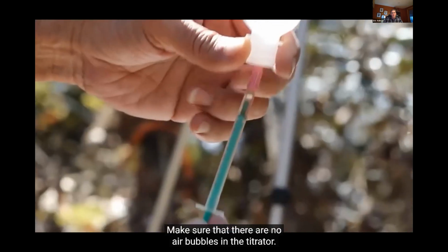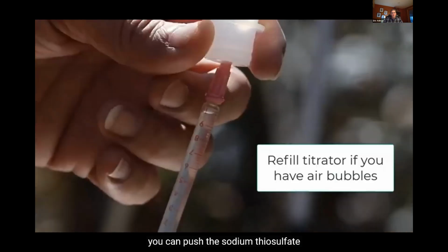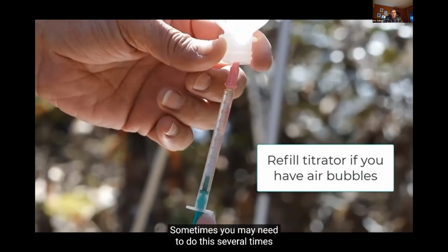Make sure that there are no air bubbles in the titrator. If there are bubbles, you can push the sodium thiosulfate back into the bottle and refill. Keep the bottle inverted throughout this process. Sometimes you may need to do this several times to eliminate the bubbles.